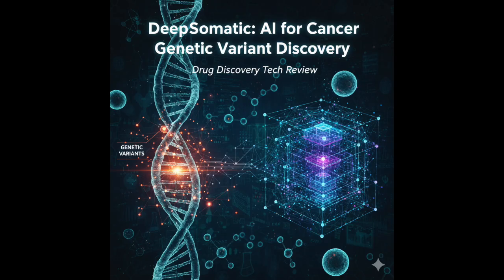It really is. Imagine you take all the individual sequence reads that cover that candidate variant position in the genome. The script stacks them up visually. Crucially, reads from the normal sample are put in the top half of this image or tensor. Okay, normal on top. And reads from the tumor sample are put in the bottom half. Tumor on the bottom. So the CNN literally sees them side by side. Precisely. It provides immediate visual context. The CNN can directly compare what the inherited DNA looks like here versus what the potentially mutated tumor DNA looks like here. It's not just subtracting one from the other statistically. It's a direct visual comparison.